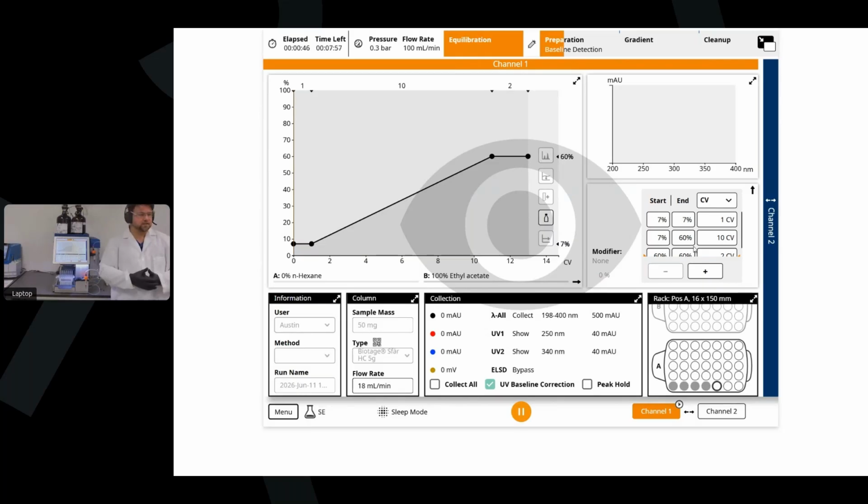And while it does that, I'm going to open up a chance to take a question from the audience, or maybe our next poll question, Simone. Sure, we'll do our first viewer question. If I already have an analytical HPLC method, how quickly can I translate that into a flash purification method on the Selekt? Sure. So I'm assuming you're doing reverse phase with HPLC.